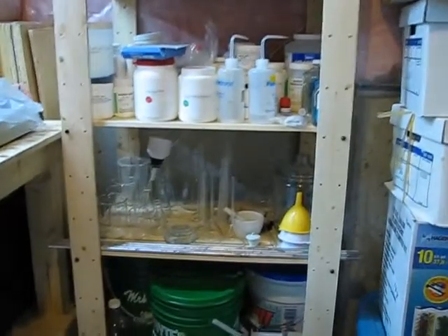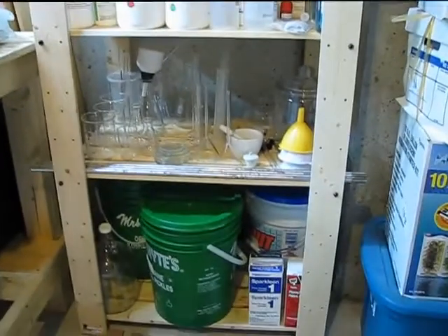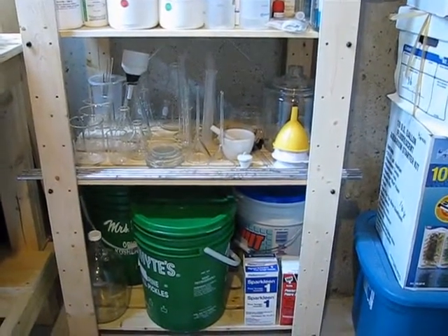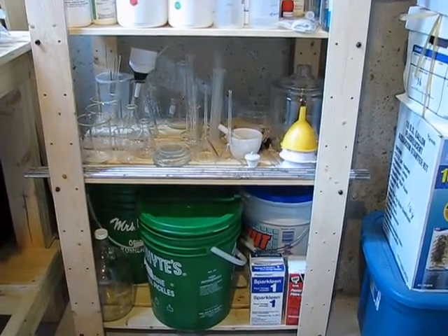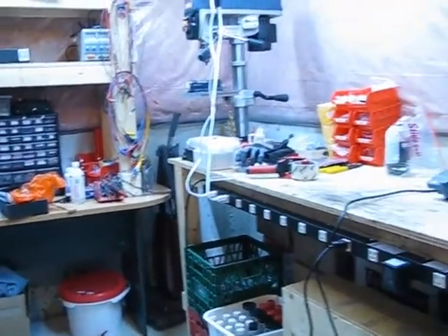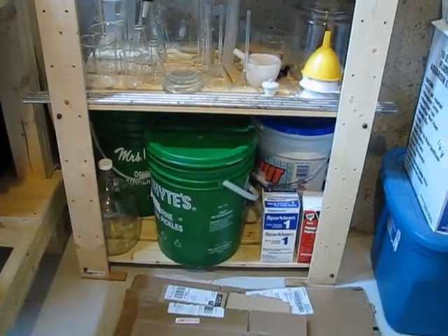Hello everyone. It's been about three weeks since I've last posted a video — been on vacation, finally got back, unpacked, readjusted my internal clock, and been working on cleaning this space up so I can actually start doing experiments and videos. So I decided I would give a little video tour of the lab, starting on this shelf from the bottom.